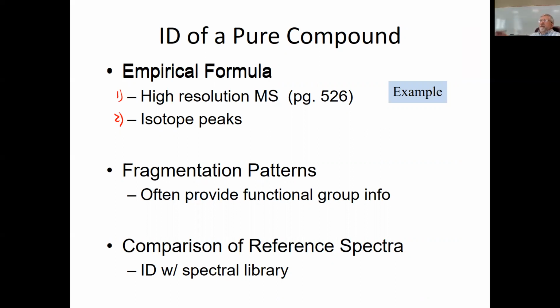If you have a molecular ion peak and then you have a loss of 15, well, that's a loss of a methyl group. Loss of 29 would be an ethyl group. Loss of 37 would be a... 39? Oh, 29 and 12, I guess maybe would be 37. Would be the loss of a.